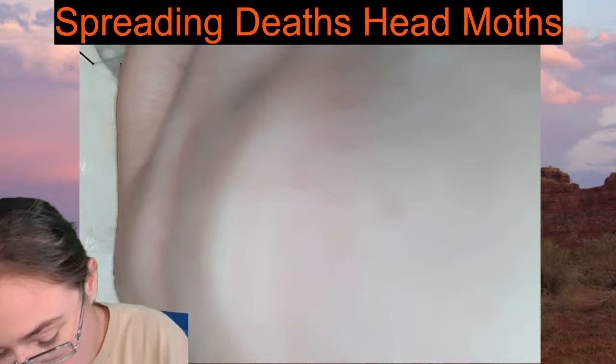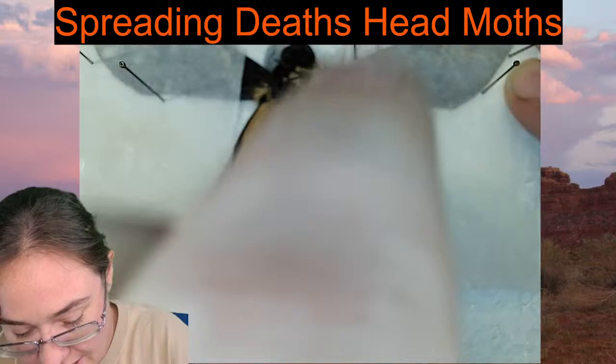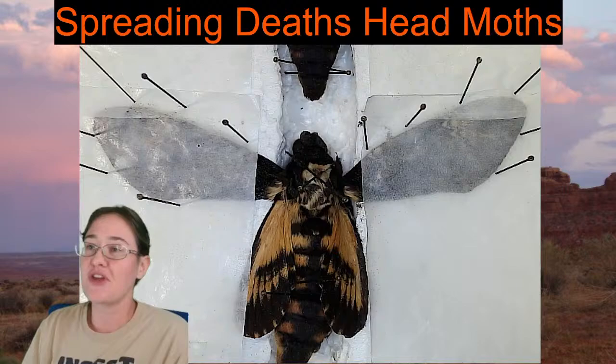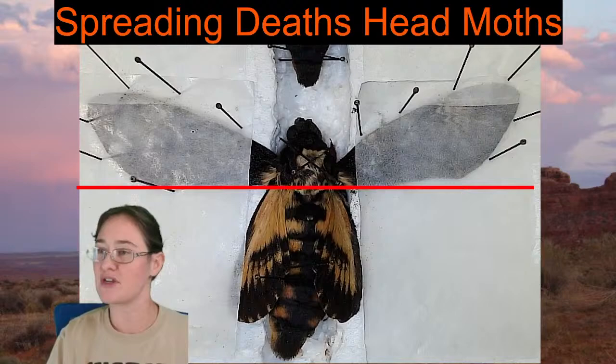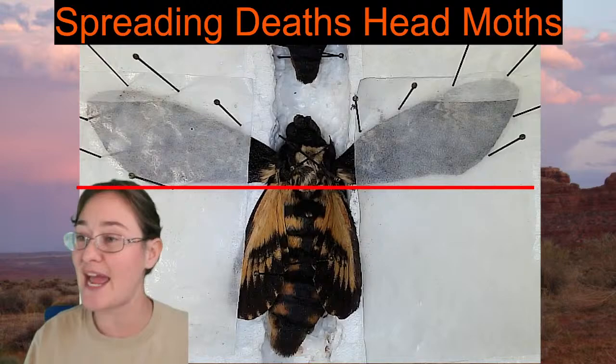So this is going to tag our wing down so that we can make sure that there's this horizontal line here. If you've been around when we've spread these moths before, you know that I have a line here, and it's directly horizontal, so as long as I line my abdomen straight up and down, this will tell me if my wings are lined up. So it looks like my left one is actually pretty good, and my right one has to come down just a little bit.